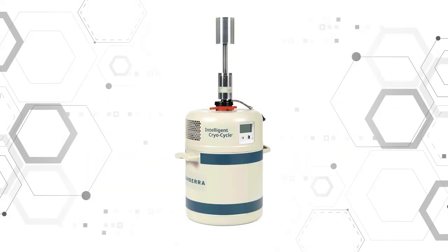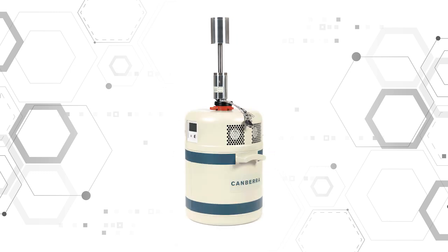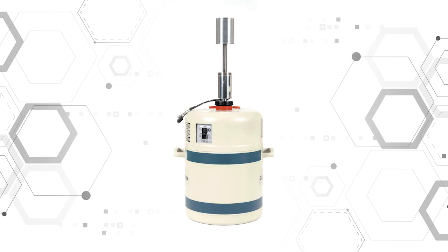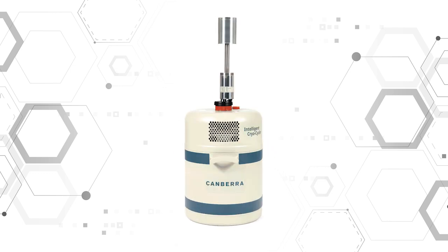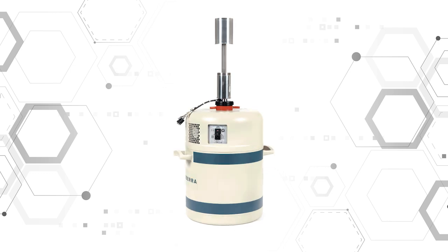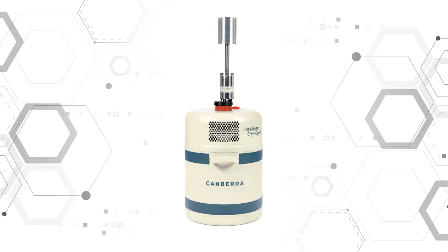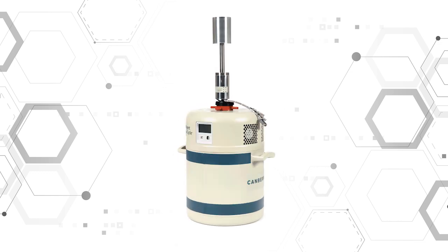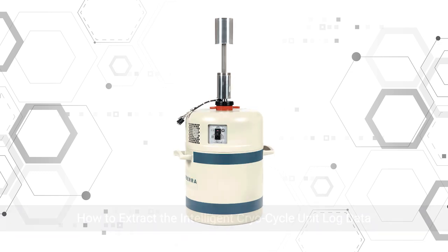The Intelligent Cryo-Cycle unit is crucial in your detection system, as it is the cooling source for your germanium detector. Without adequate cooling, there are no measurements. This is key so that you can rely on your cryo-cycle unit and monitor its state of health at all times in order to optimize the uptime of your system. These two requirements were the drivers for the design of the Intelligent Cryo-Cycle unit.